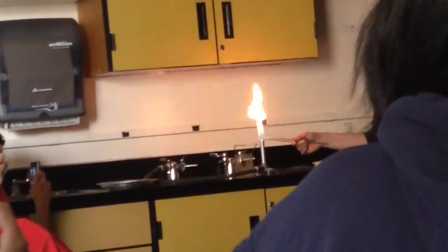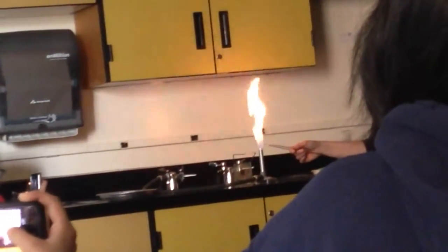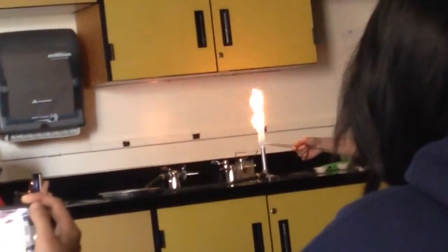I'll tell you when to push record, so stop recording now. It's been a legitimately long time. Last year it would have already happened. So I'm trying to Google what happened to my magnesium — I wondered if maybe the longer it's exposed to something, or if it got wet, or something happened. I'm making the flame do that.